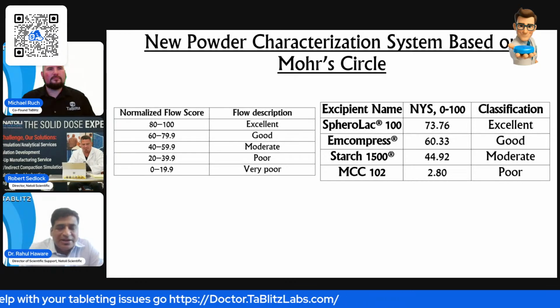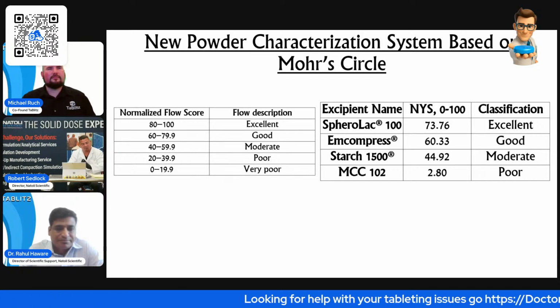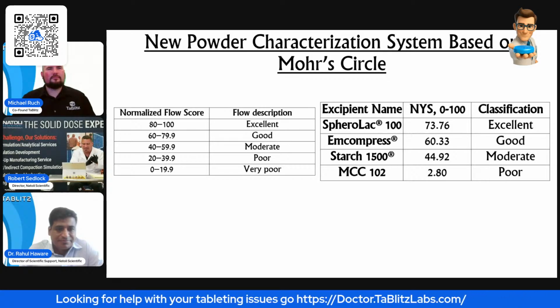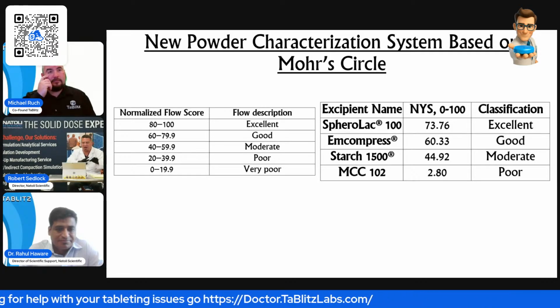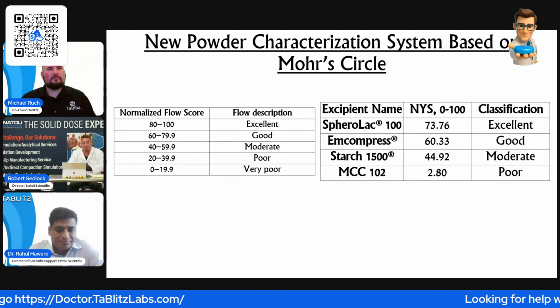Depending on bulk density, we require between 50 grams to 75 grams. So only 50 to 75 grams. You don't have to purchase the tools yet. We've got these steel coupons made of different steels like M340, chromium nitride, zirconium, just all the different steel types and coatings that are offered by Natoli.